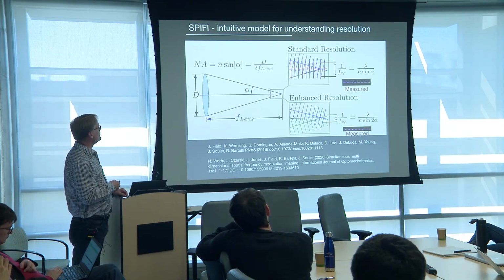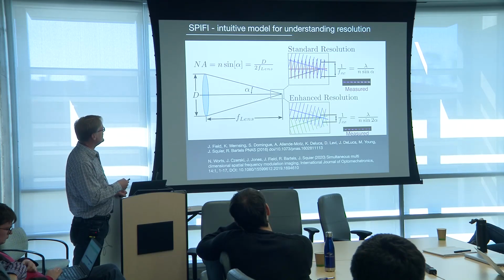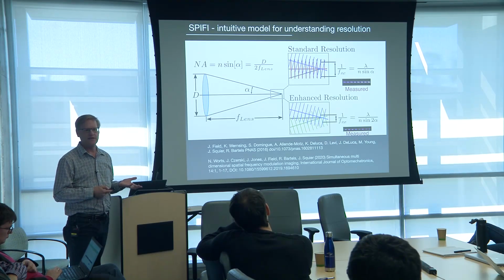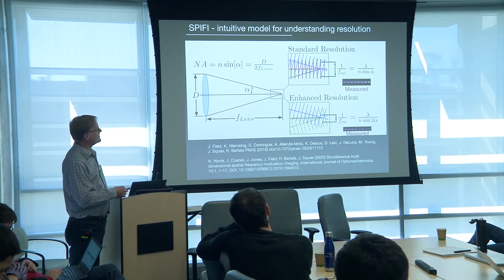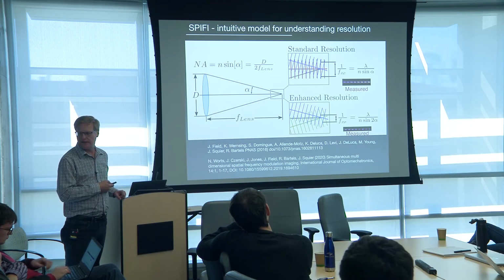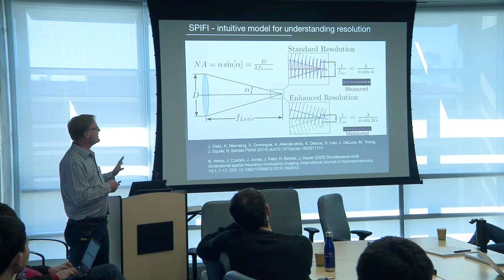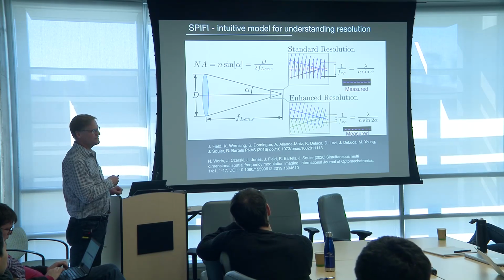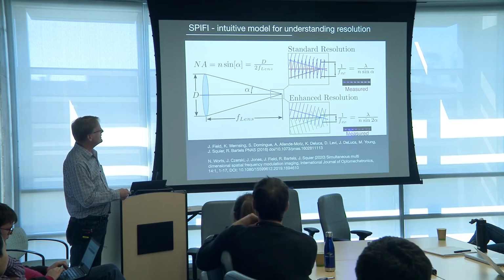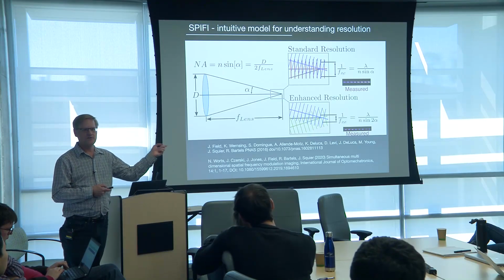But what if we could separate the image created by light sheets going down at the marginal ray angle? That cutoff frequency is much sharper because it's at double the angle. So I've allowed light to go through the edges, and you can literally just put a wrench here and block that central light sheet. And you can see you get twice the spatial frequency.